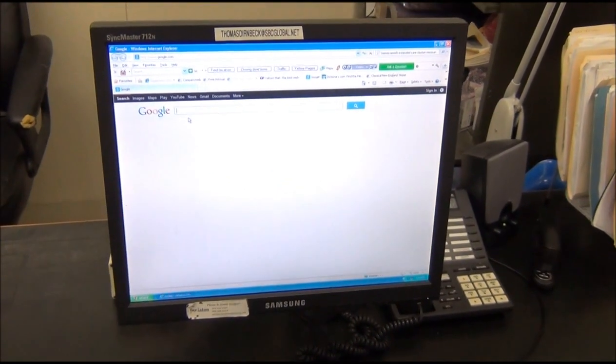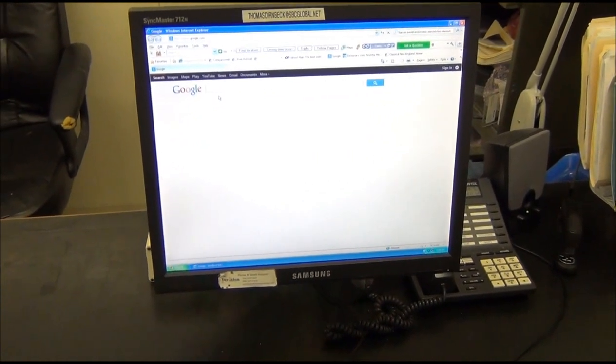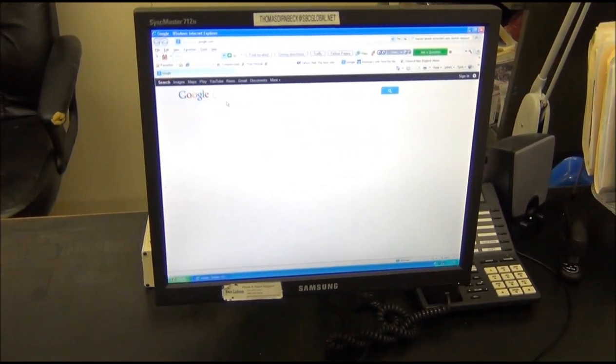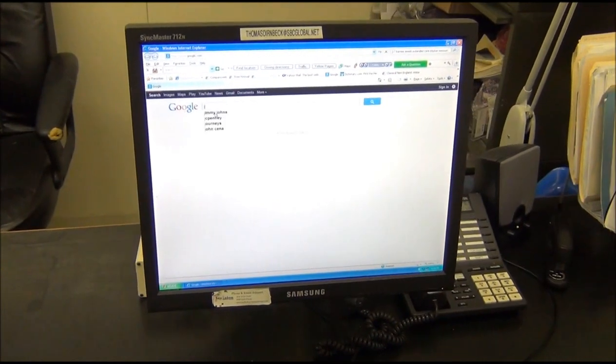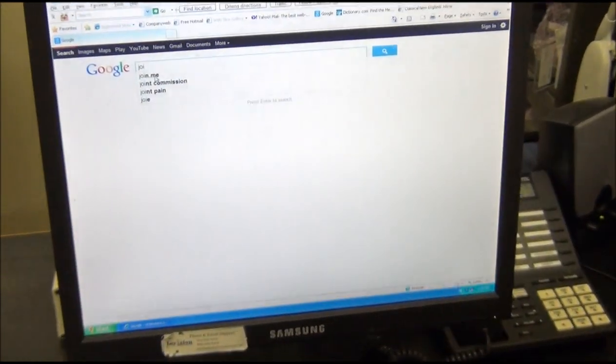Okay, the question comes up periodically: can someone remotely take control of a speckFINDER system? And the answer is yes, we can do that. The way to do it is to install, on the speckFINDER system, a common linking software called Join Me.